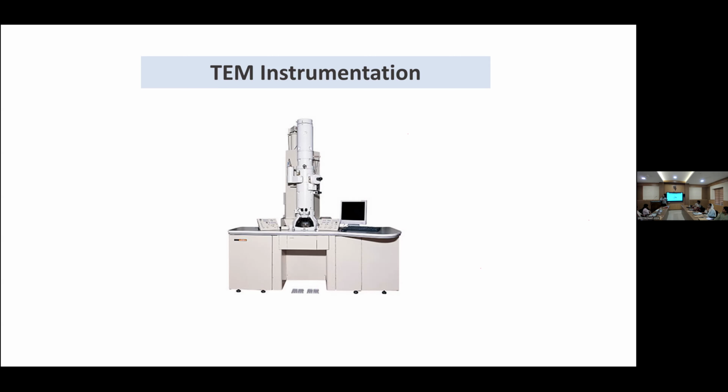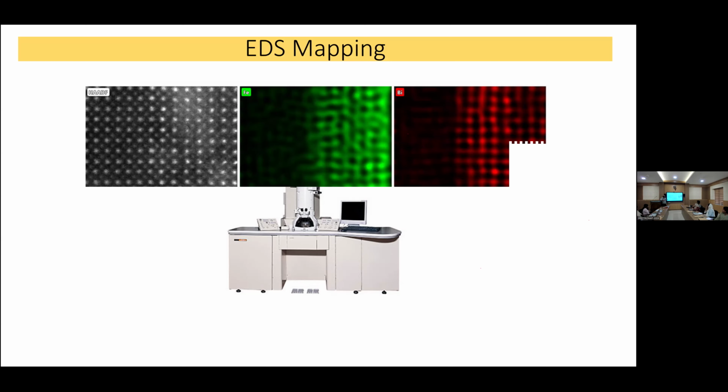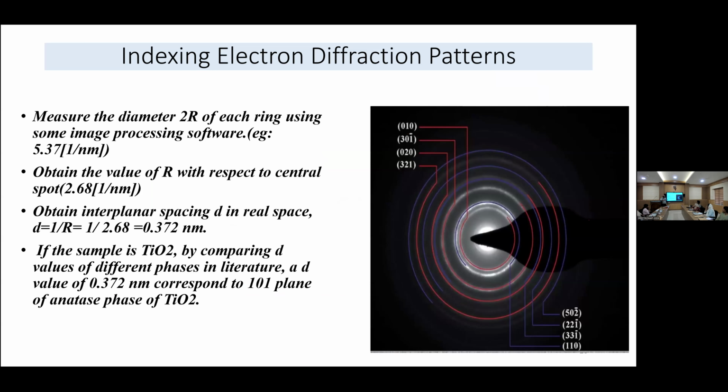In SAED patterns, yes, that is because of the direct image. Because in the SAED aperture, we get scattered electrons as well as transmitted electrons. That is why we are using one beam stopper. You see here, this is the beam stopper, because here it's a very bright area, so that affects the brightness here. So in software there is a compensator. So if there is something bright, then all the other dark regions disappear. So we are using this beam stop.